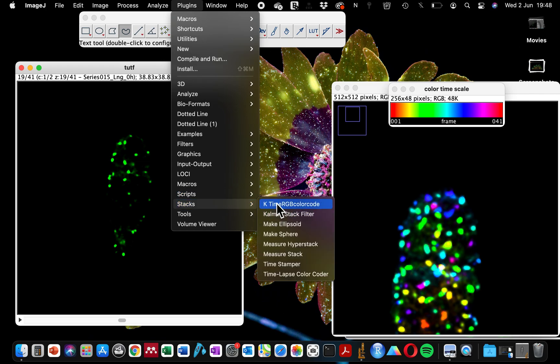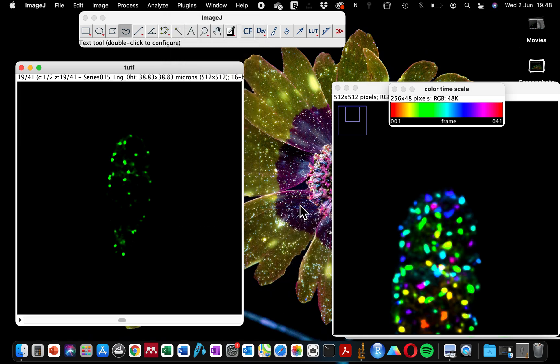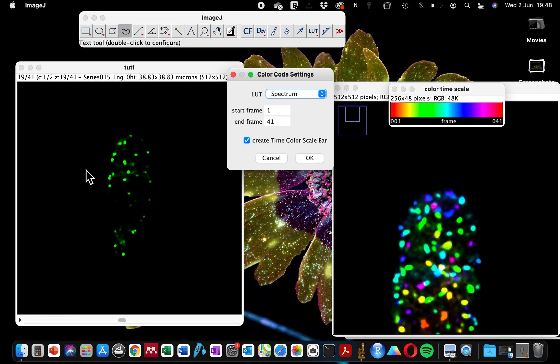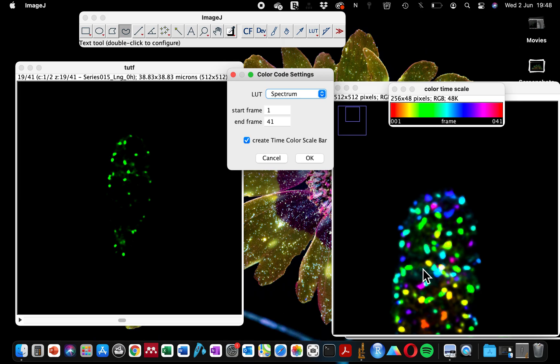I'm going to go to Plugins again, Stacks, Z time RGB Color Coder. This function will give you two types of windows. One is a Z-stack. It will generate a different Z-stack image with a different color coding depth.